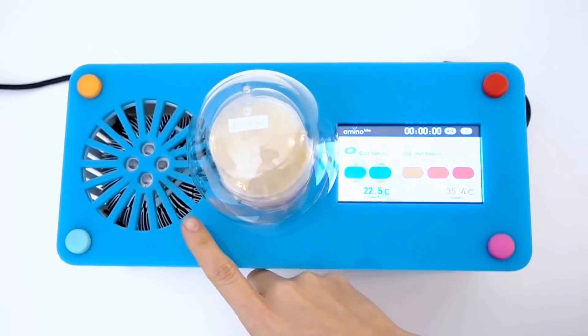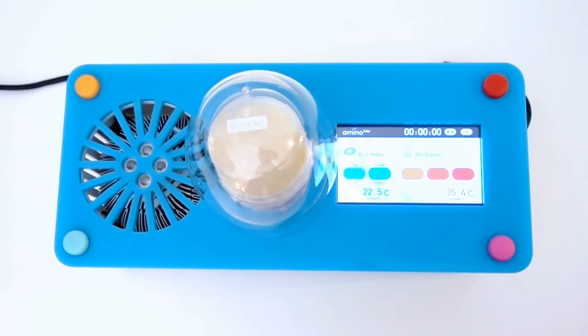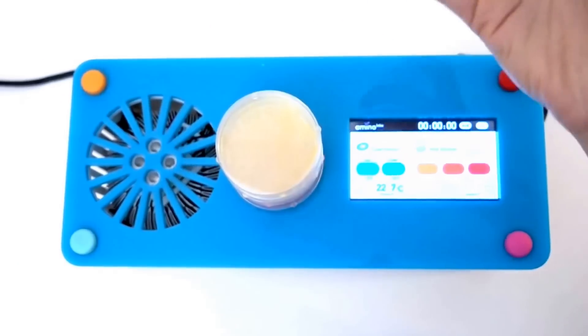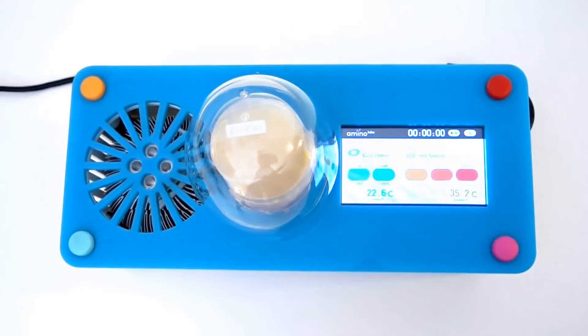so you don't need an ice bucket, thermometer, and a constant supply of ice that always leads to a big mess. It has an incubation station to heat tubes and grow microorganisms at the right temperature.